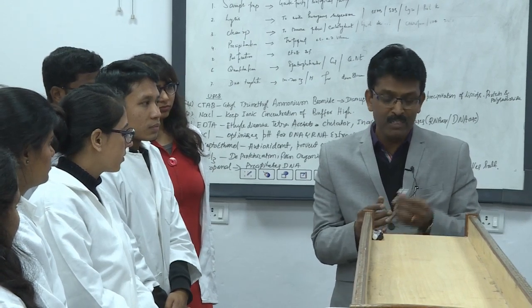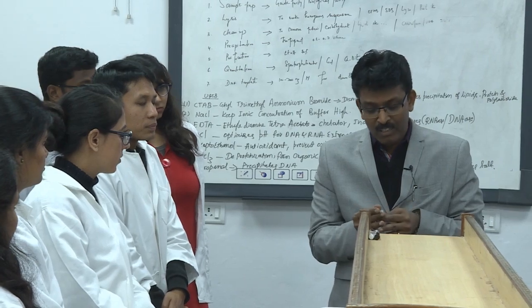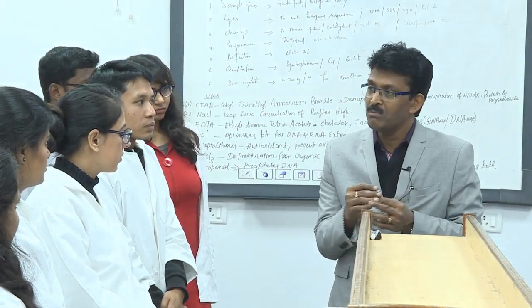Remember always in your mind, on a small tube like this you cannot write too big, but you can easily write around 4 letters or 5 letters here on the side. Okay. So, the coding system is very important.